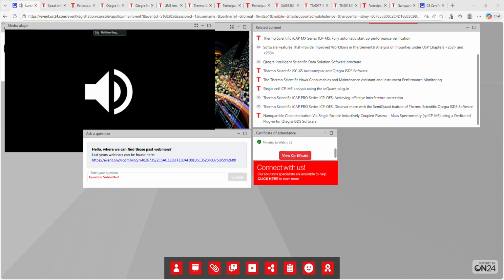Thank you. We usually report 2 decimal places and so are manually rounding results down. Is there a way to deal with this in Qtegra?